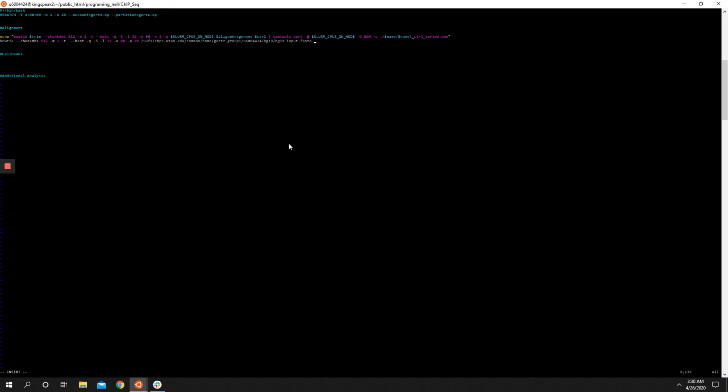If you write to standard out, it'll print out on your screen. So we don't want it to write to standard out because that's absolutely worthless. So we'll use what's called a redirect, which is this, and it points to this, and we'll call it input.bam. So that'll spit everything into a file called input. Okay, so that's what we would have done.